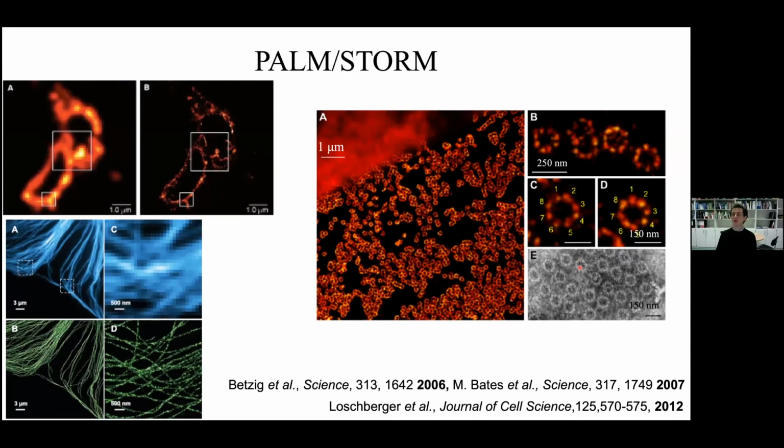Okay, so these images, which are really eye-catching, are meant to show you that the optical microscope, which somehow started unassumingly as a not very technologically innovative instrument compared to other microscopies which have become available over the last decades, can actually, with some clever combination of dyes and analysis schemes, give you resolving power which is comparable to that of an electron microscope.